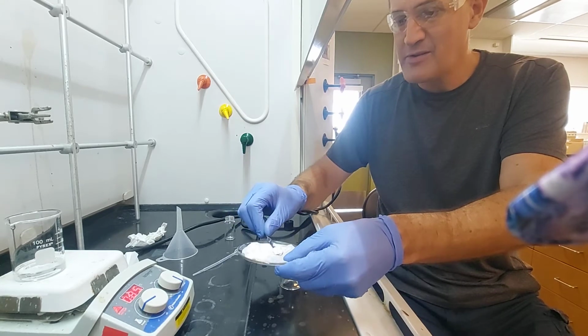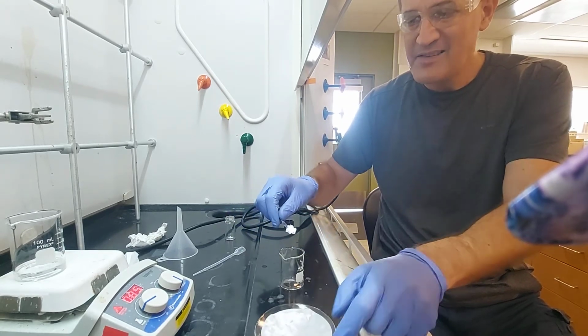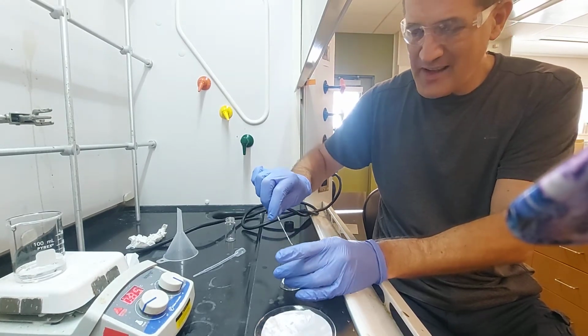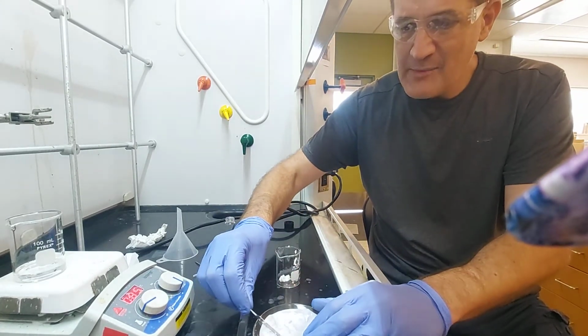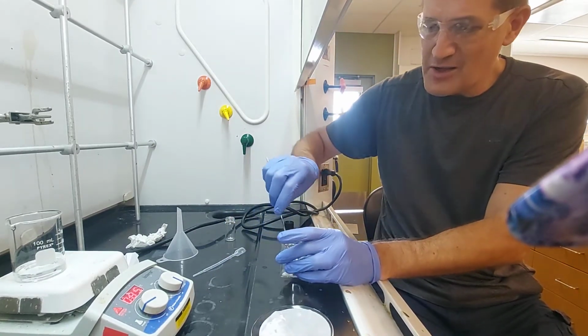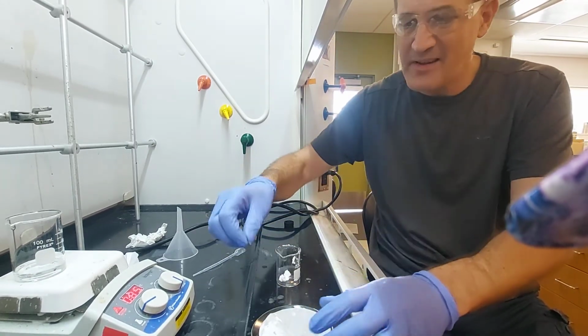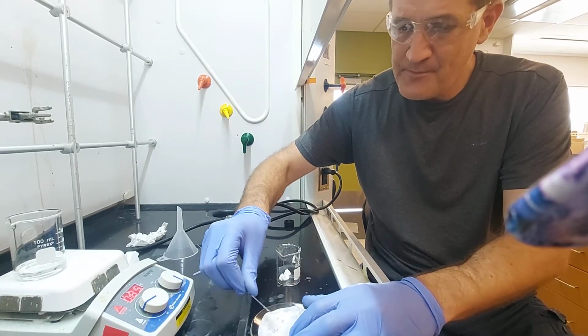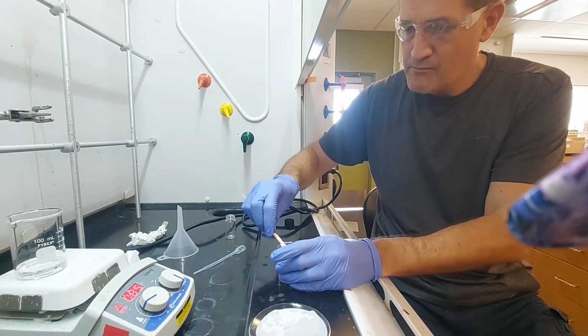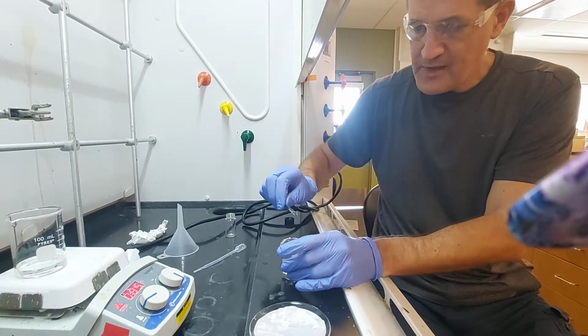So I'm just going to scrape. Now you can see this stuff is pretty wet, but that's okay. It's going to stick on the sides of the flask a little bit, so I'm just going to get this out as best I can. It's not going to look wonderful, but this is dry enough that it is coming out. And if you're storing this for a week, you can put this directly into a vial and store it that way.